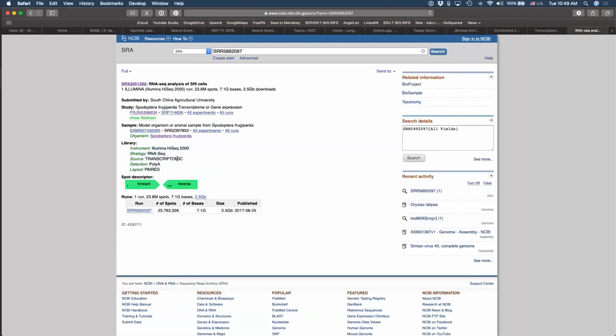For example, we see that this is RNA-seq, this is Illumina data, and this is paired end read, right? So all of those inputs that we started with in the beginning, typically they're going to be given right here. Unfortunately, not always, and sometimes you need to guess, or you need to know by the files that you will download. Now, how do I get this raw file?